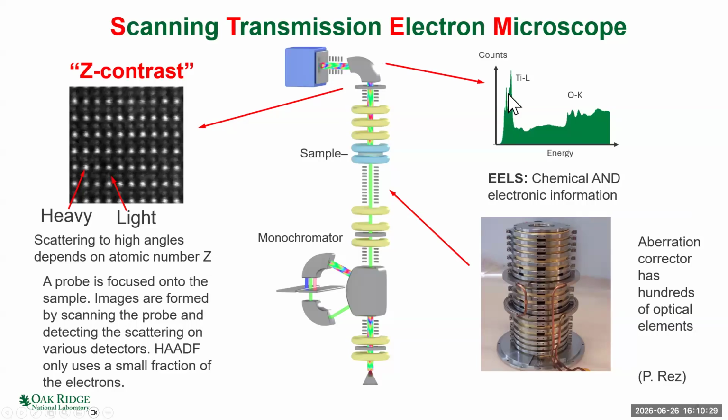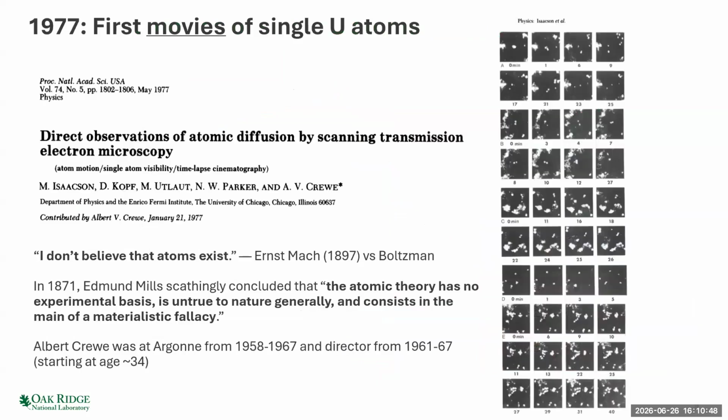You could take spectra, and perhaps an important thing for this workshop is that the aberration corrector, which is the thing I would normally talk about, but not going to cover here, makes the electron microscope, which is already pretty complicated, even more complicated. So you're going to need some sort of computer control.